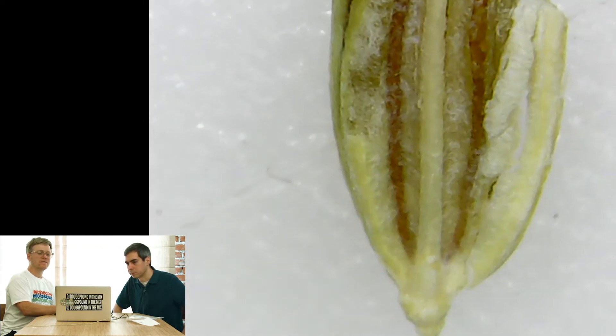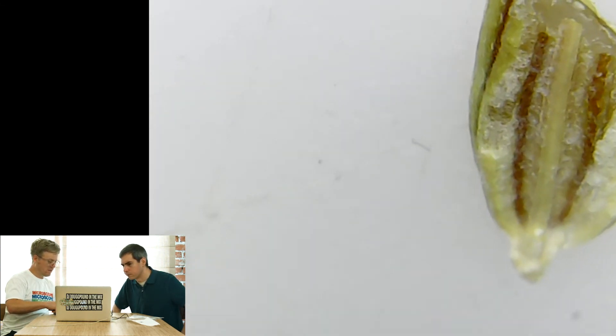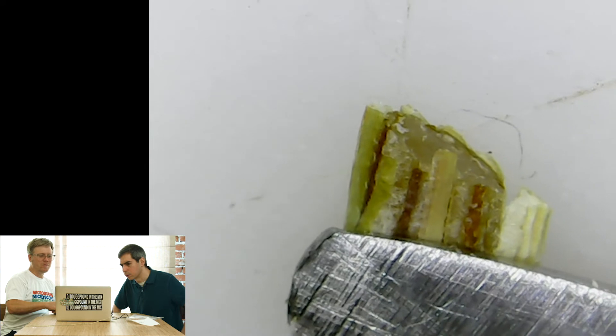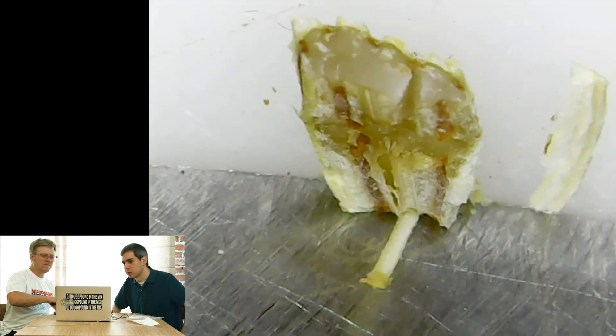On Microscope Show, we like to go inside the seed. It's some sort of substance. It's like gummy. Does it come out gummy? It's gummy bear stuff. Look at that — great shot. It's just more nut stuff. I like to see stuff up close get kind of smashed. It's just almost a nut of sorts, isn't it? I'm gonna smell it. Yeah, it's got that anise. Oh, does it? Can I get a smell? Oh yes, I love that smell.